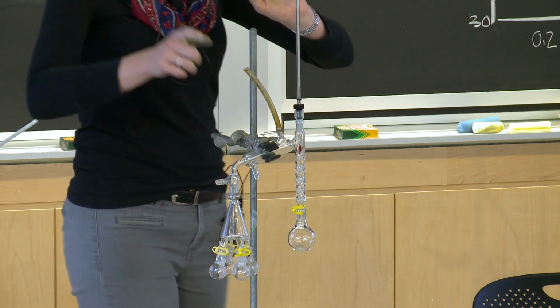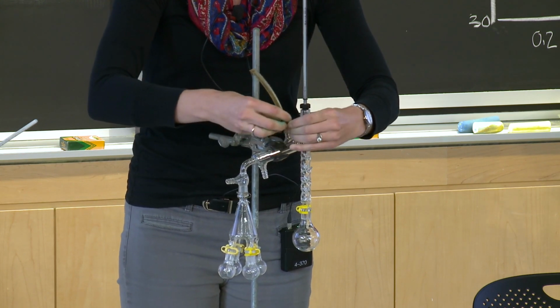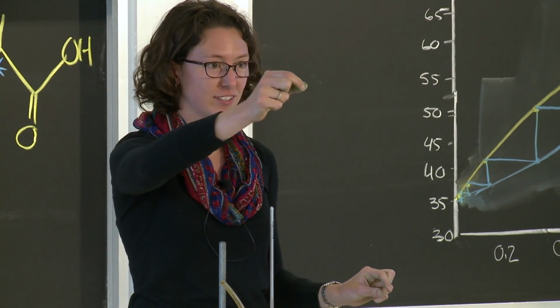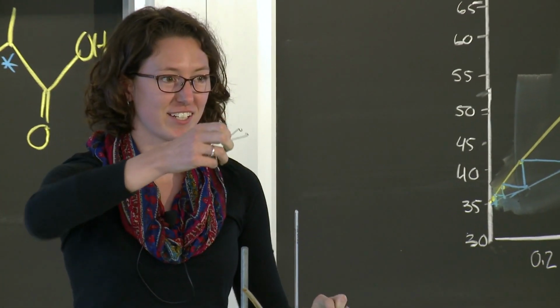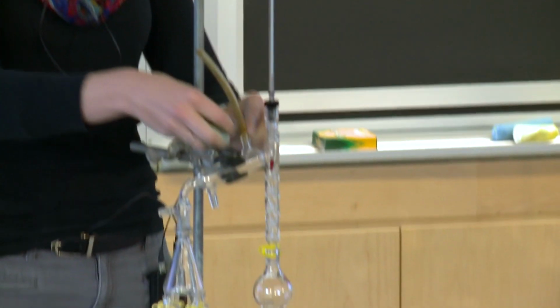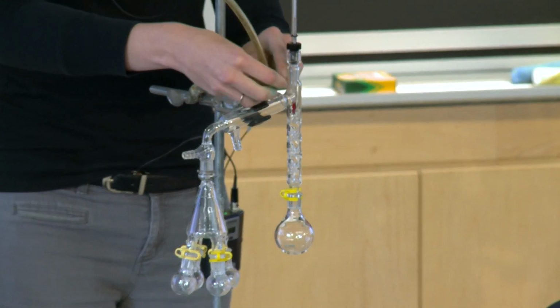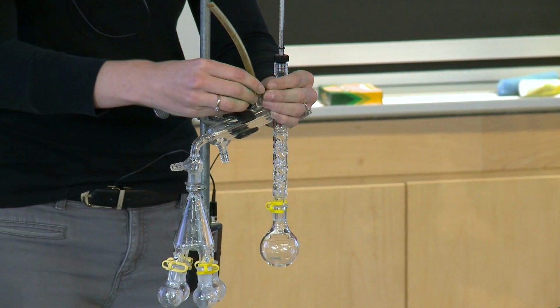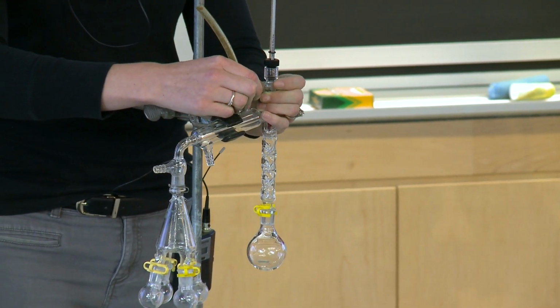And this could be possibly the most important thing I will tell you today. This little metal piece is very important to the success of your lab. Does anyone know what this does? So this piece goes, when you attach your tubing from your water lines, you want to have one of these little metal guys, and it'll wrap around your tubing and your glassware, and then it'll clip together to secure your glassware to your tubing.